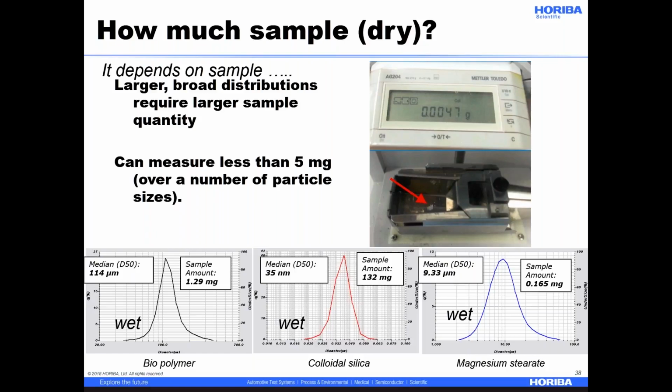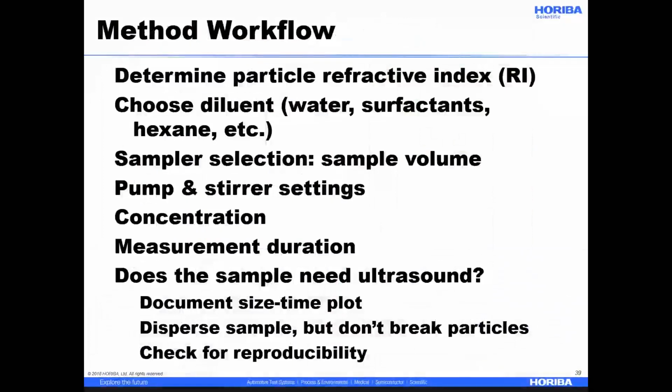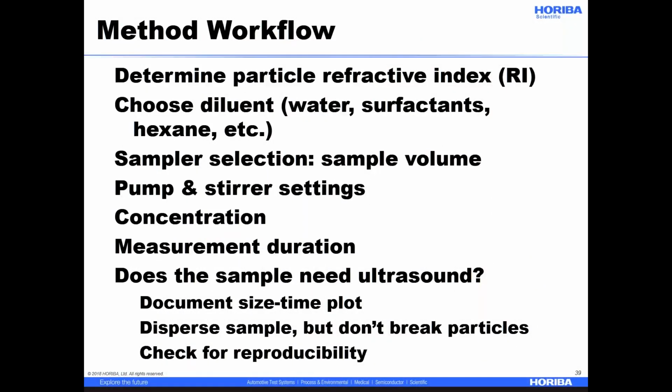So that's quite a bit of fun in terms of measuring tiny amounts of dry material. So determining a method, which is really what drives that sample prep, can be exciting. And really, the reason you pay attention to your method is once you're running it over and over, you want to make sure you always get to the same answer for the same sample.